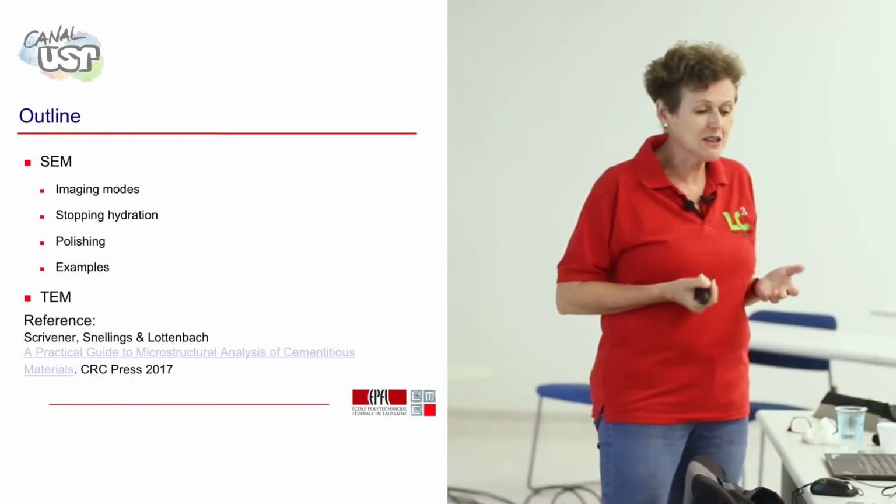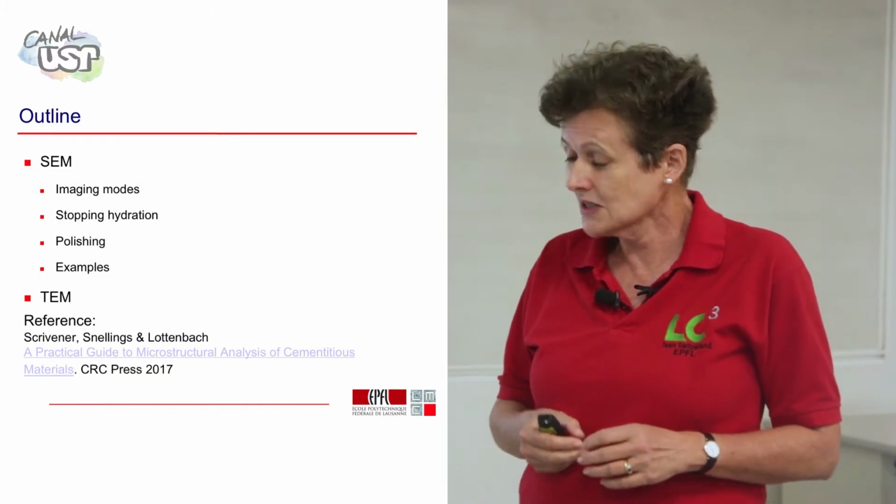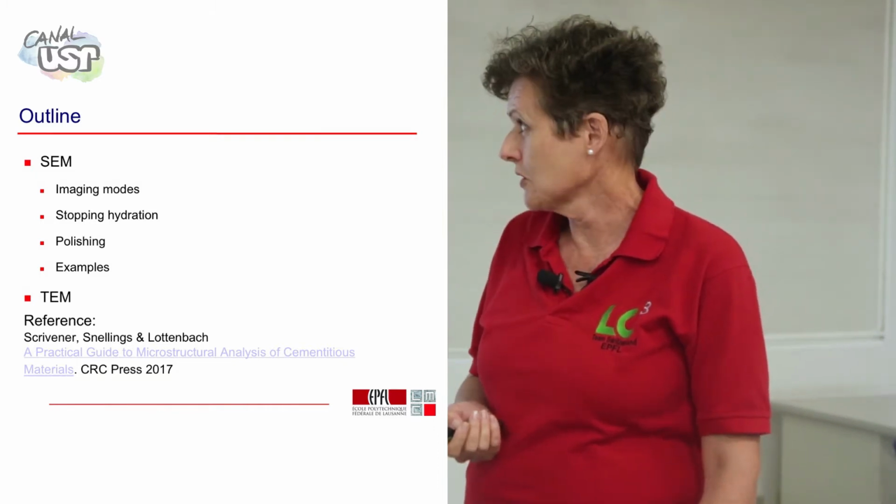Of course, there's an awful lot more you can do with microscopy, and I could probably spend a whole day talking on different things you could do with microscopy. So we haven't got time to put everything in. But we'll try and talk about the essentials and mainly the practical essentials of how to prepare samples and how to get good polish.